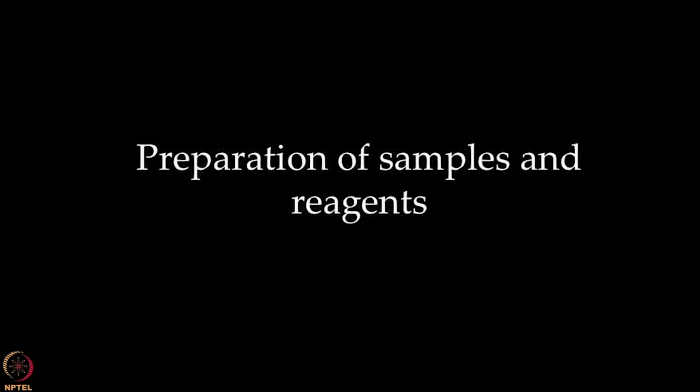We will now work on the reagents required for the screening assay for binding of proteins, human serum albumin and carbonic anhydrase, against several small drug molecules.